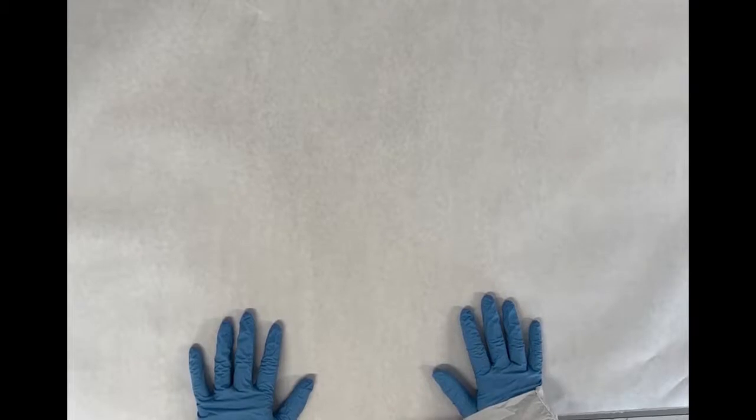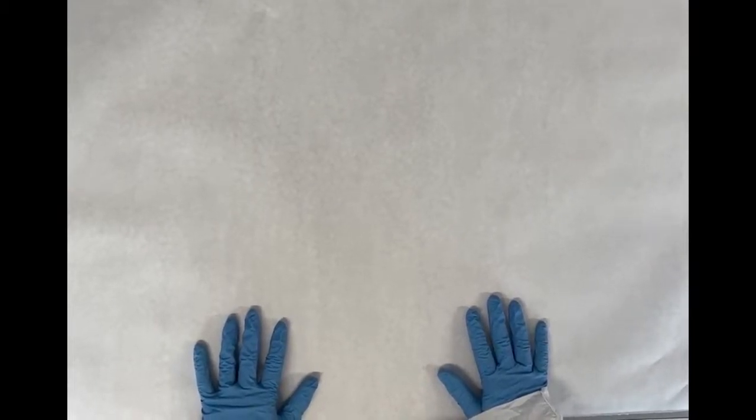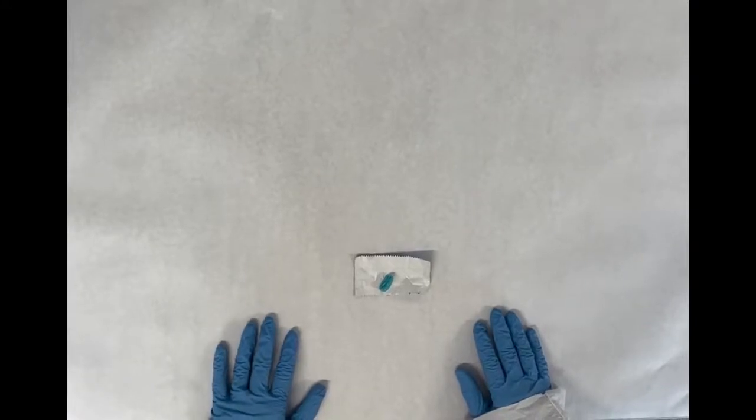Today we are going to be showing you how to properly package one of the more unusual items of evidence that we receive for DNA analysis: gum. Only gum known to have been chewed and discarded by the perpetrator should be submitted for testing.